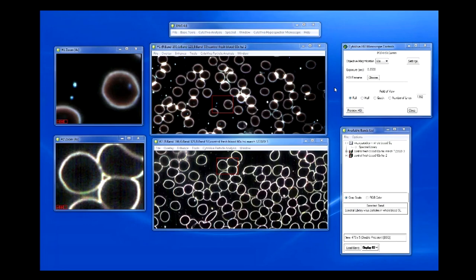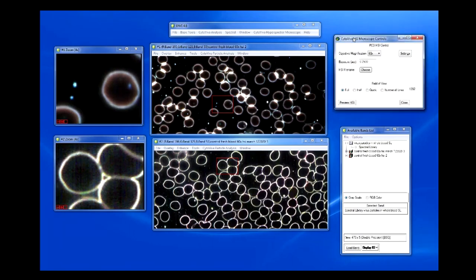We're going to come off of the PowerPoint and go right into a hyperspectral image so you can observe what a hyperspectral image is and what you can do with it — sort of like show and tell. We'll show you what it is first and then tell you the details about how it works as a follow-up.